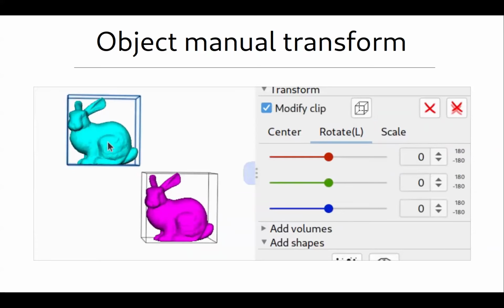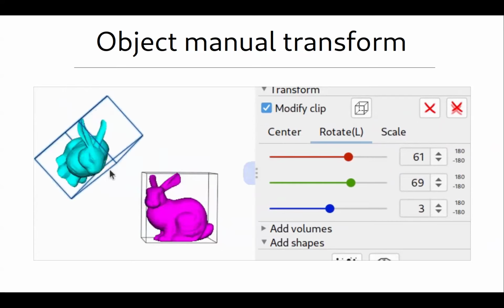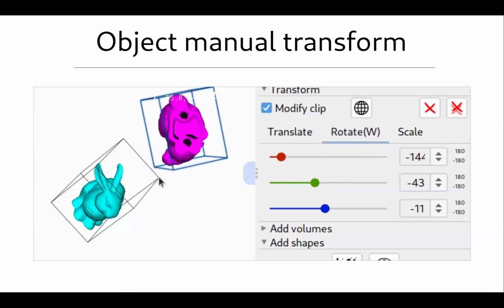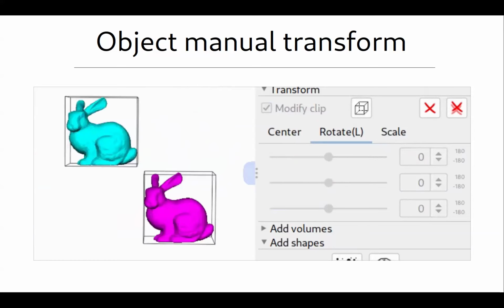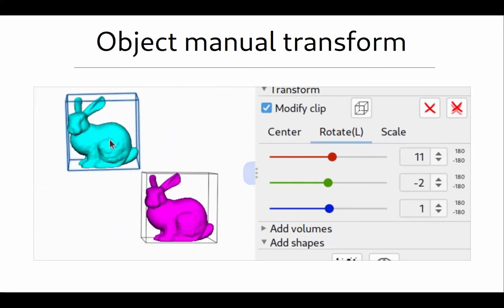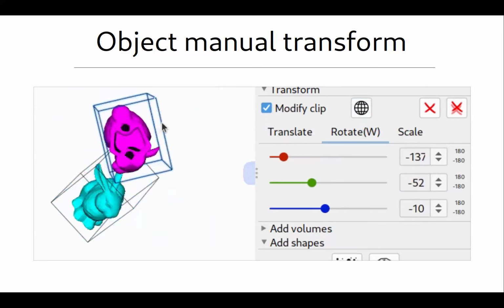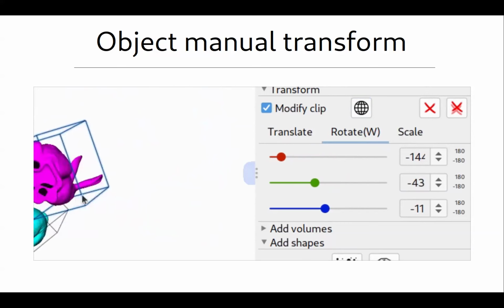There is a manual transform mode where if you press T, you enter this manual transform. Normally, in your navigation, clicking the left and right mouse button changes the camera. So it does not move the objects, it moves the camera around them, right? But in this transform mode, depending on what is selected, and I use it a lot, it's actually pretty handy because it's much easier to visually move things rather than try to move the slider and find the proper position. So when you enter this mode, the camera is not changing, only the selected object's orientation is changing. We're going to try that later too.